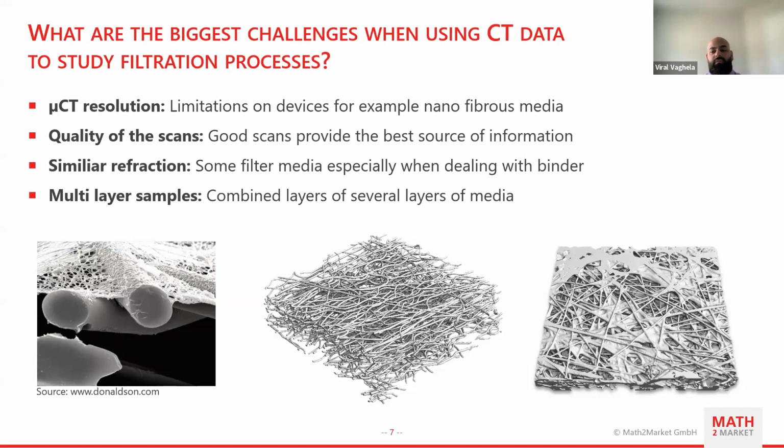And very lastly, we of course also have the capability to use the software in the cloud. So for example, if there are hardware limitations, which we sometimes face with very large data sets at very small resolution, you could use the software in the cloud, which lends us the capability to have very large hardware without purchasing it ourselves.